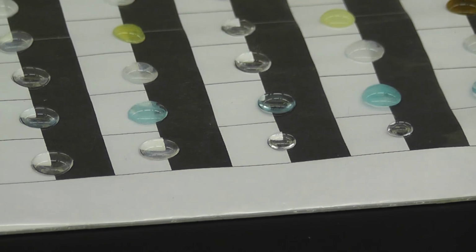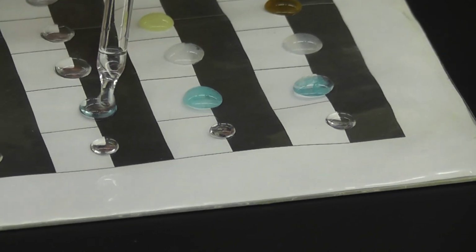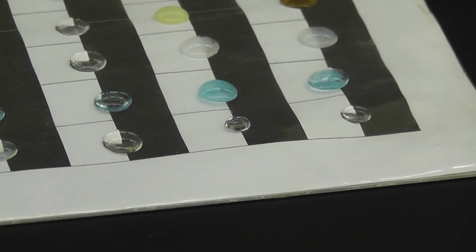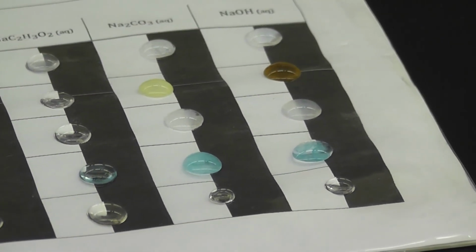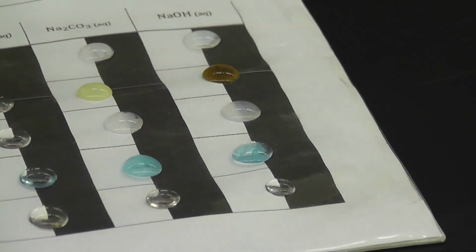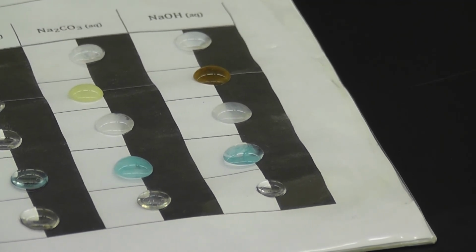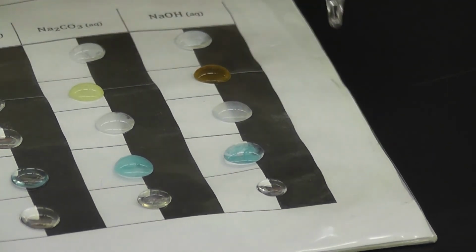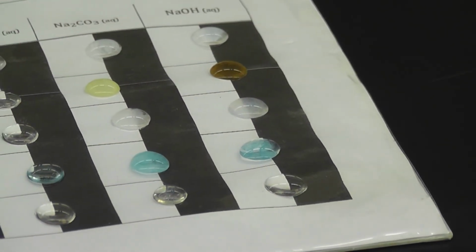Next is the sodium acetate. So I'm going to take this drop of sodium acetate and add it to the iron 3 nitrate. That's the sodium acetate. 2 more. Okay. Next is the sodium carbonate. So I'm going to add 1 drop of sodium carbonate to the iron 3 nitrate. That's sodium carbonate. And lastly, sodium hydroxide. So I'm going to add 1 drop of sodium hydroxide to the iron 3 nitrate. So here's sodium hydroxide. Okay? Now record all your observations in your lab report.